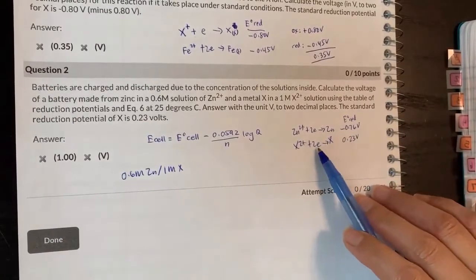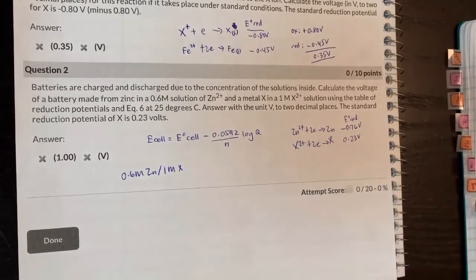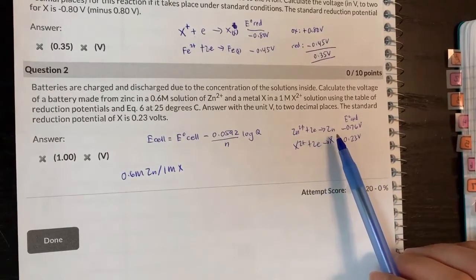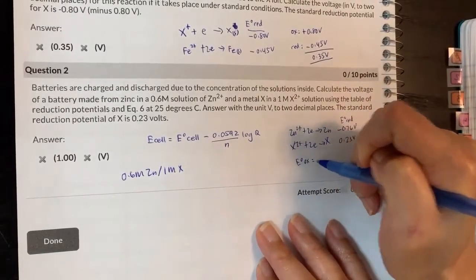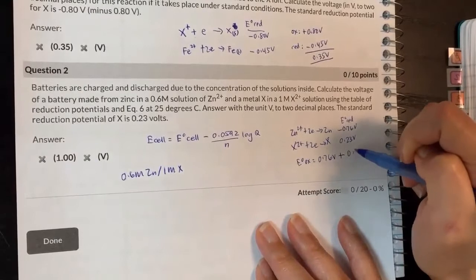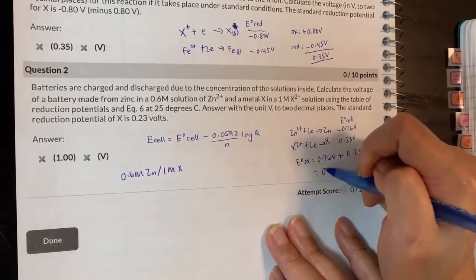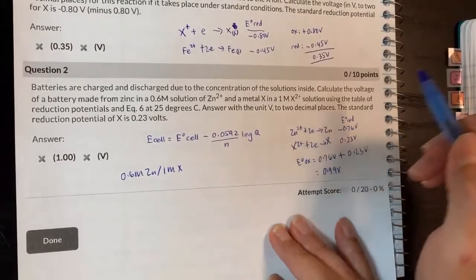So I'm going to say this guy is going to reduce, that guy is going to oxidize, okay? So the zinc is going to oxidize here. So my E of oxidation is going to be 0.76 positive value. My E of reduction is 0.23 volts. So I should get a value of 0.99 volts.